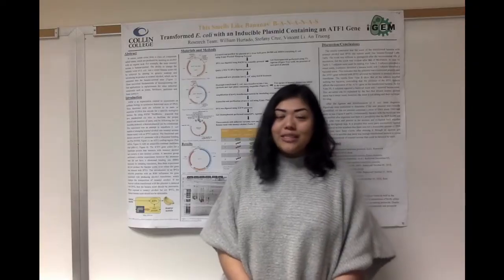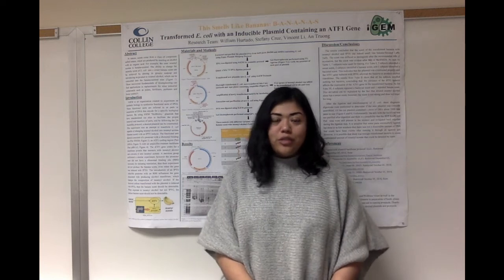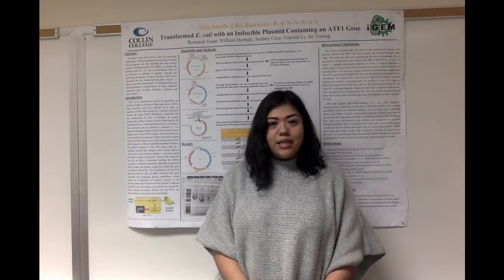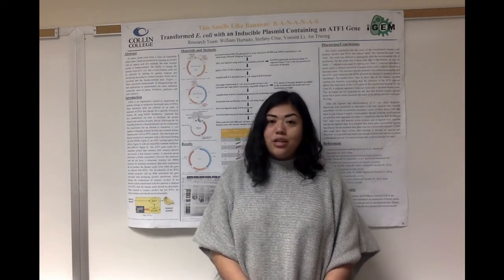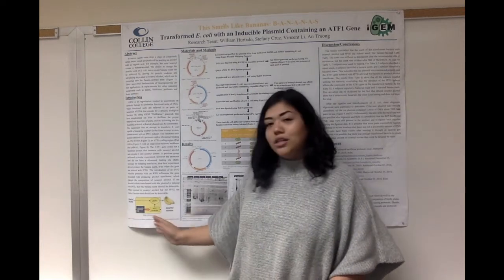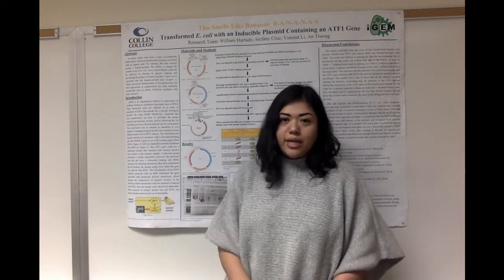This experiment was an attempt to transform the smell of E. coli to a more pleasant banana smell by inducing it with a plasmid containing an ATF1 gene. This gene encodes for a transferase protein capable of changing isoamyl alcohol into isoamyl acetate, producing the banana smell.